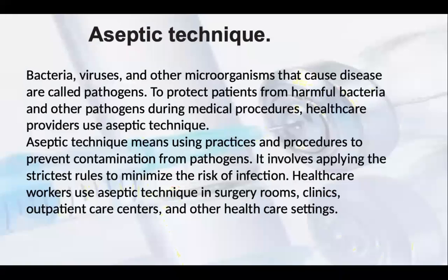Now, what is aseptic technique? You may have learned the aseptic technique. Bacteria, viruses, and other organisms that cause diseases are known as pathogens. To protect patients from harmful bacteria and other pathogens during medical procedures, healthcare providers use aseptic technique. Aseptic technique means using practices and procedures to prevent contamination from pathogens. It involves applying strict rules to minimize the risk of infection.